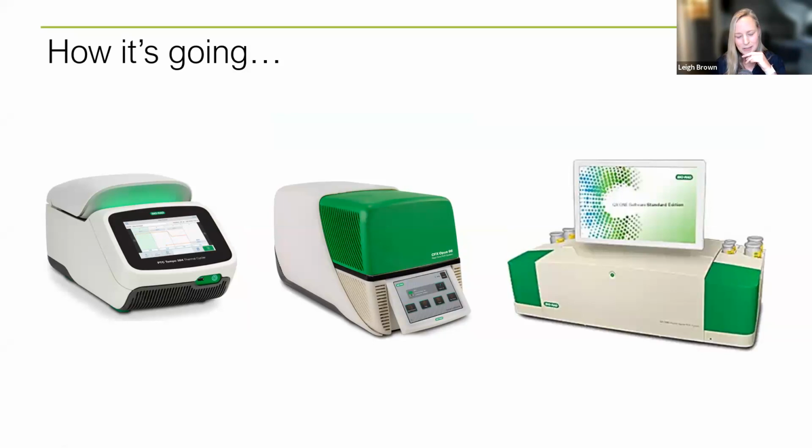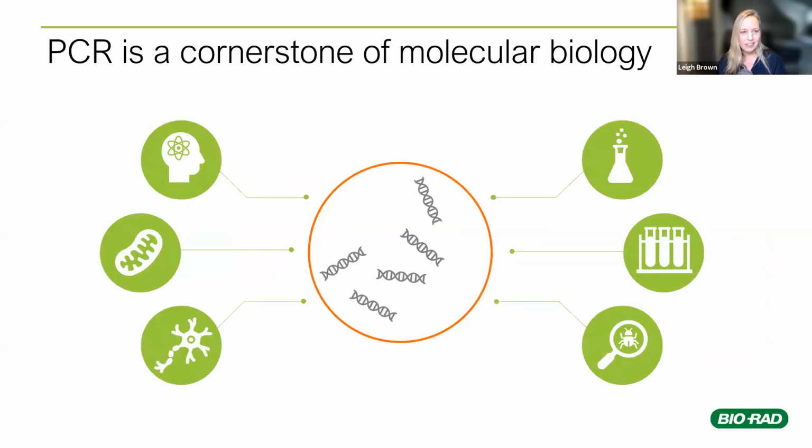I'm not going to talk a lot about digital droplet here, but we have a whole webinar coming up where we're really going into detail on that. And that's kind of where the field, especially of wastewater monitoring, is going. So I'll put that information up at the very end. We've come a long way in not very much time, right? This started in the early 80s. And so we've really made some major strides.